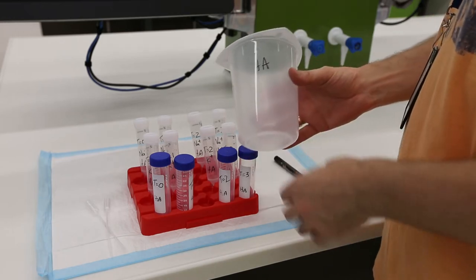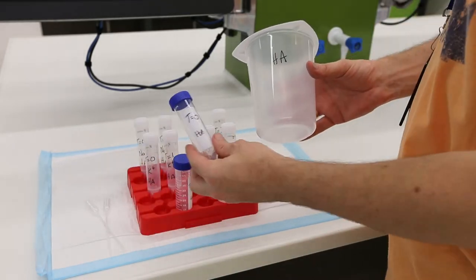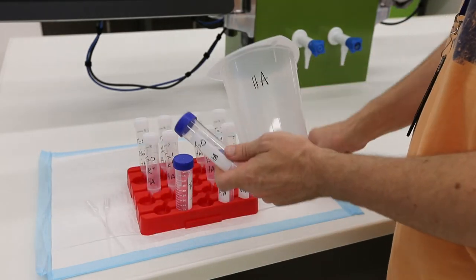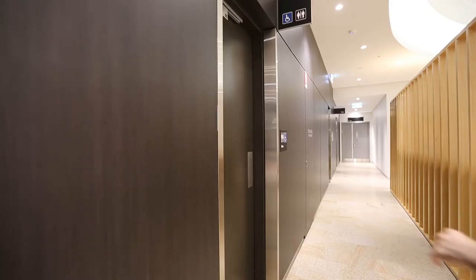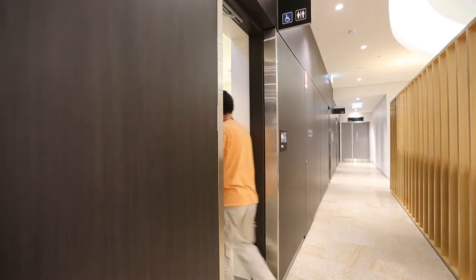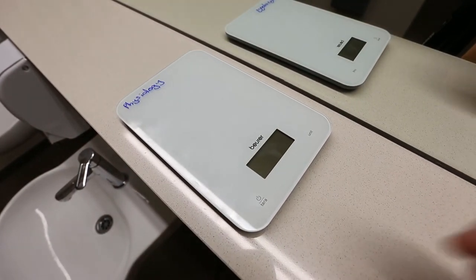To collect a sample, you will need to take your beaker, the 50 ml falcon tube for the respective time point (in this case T equals 0), and your texter. In the bathrooms you will find a set of kitchen scales. To turn them on, press the tare button.